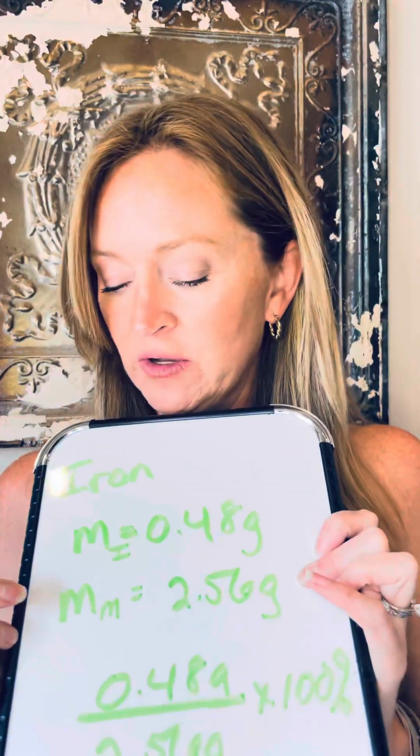And then the equation that they give you says to divide that by your total mass, okay? That is actually your total mass recovered, okay? Which again is going to be on table 2 where it says mixture recovered in your mass, okay? Let's say mine, this is not gonna be everyone's, but my mass of my mixture, this big M is my mass, the little m is of my mixture, was 2.56 grams, okay?